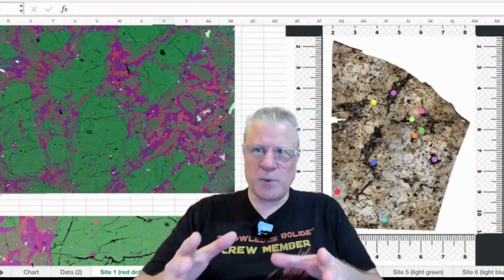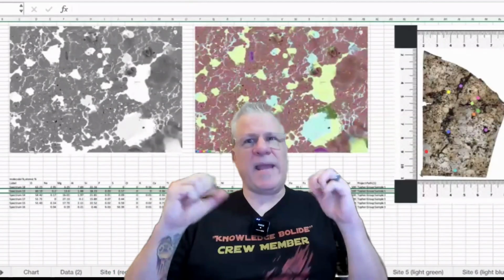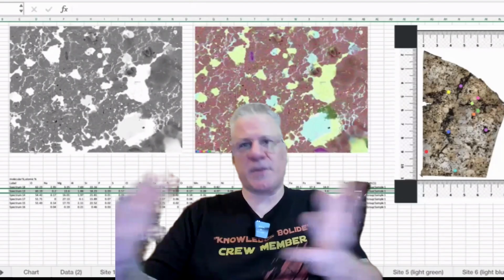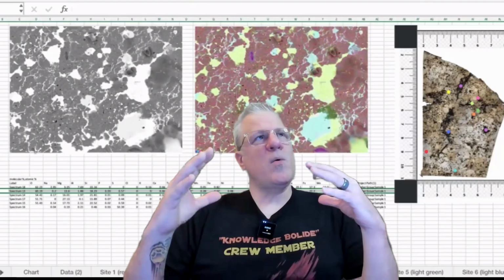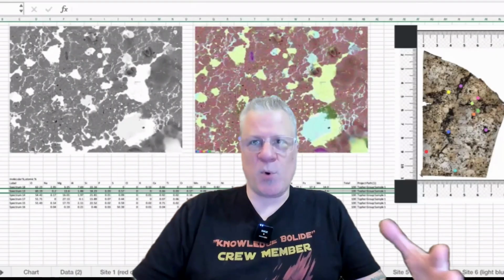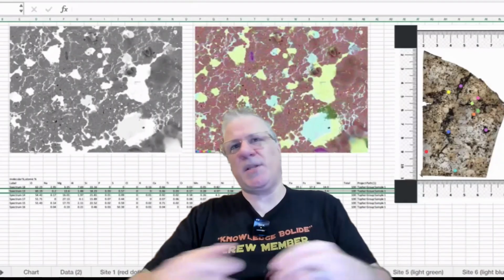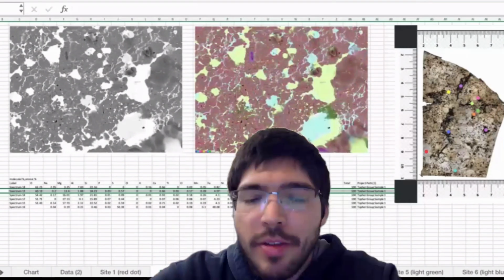Yeah, I agree. I do have a question for you about the high pressure, what are they called? Not photomorphs. The polymorphs, yes, polymorphs. Thank you. For our submission, that's not really a key important data point that you're going to necessarily pass along. You excluded it in some of our readings, but I have a question regarding our good friend Vince, who likes studying high pressure polymorphs. How do you, as a scientist, not handicap another scientist who wants to study those when it's not important to you and your classification? So that's a great point that you made, Topher.